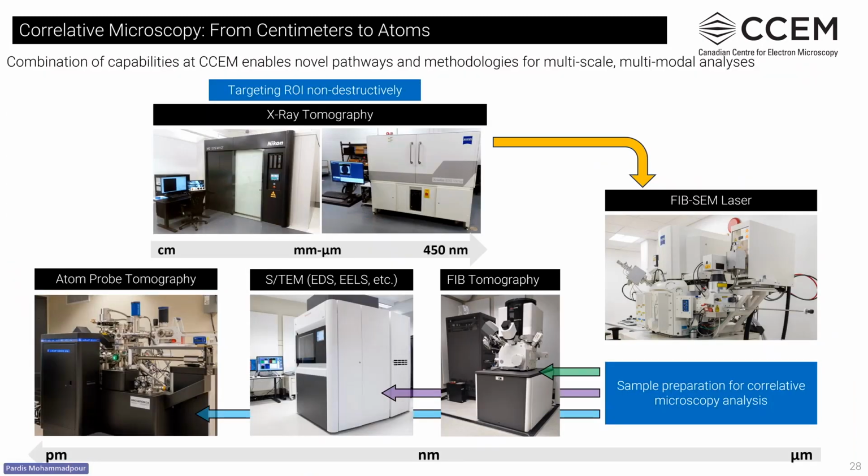The other application of XCT is the correlative microscopy. By combining our capabilities here at the CCEM, we can create novel pathways and methodologies for multi-scale, multi-modal analysis.